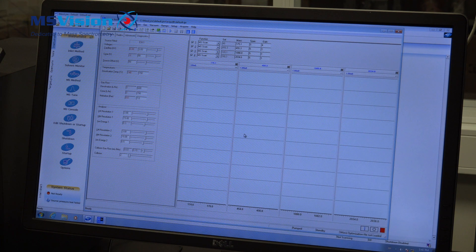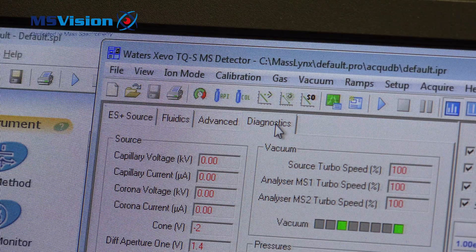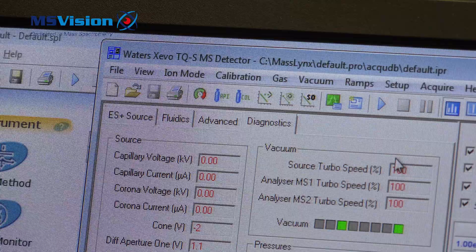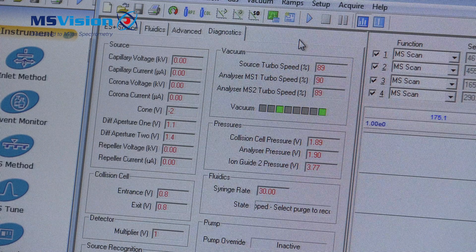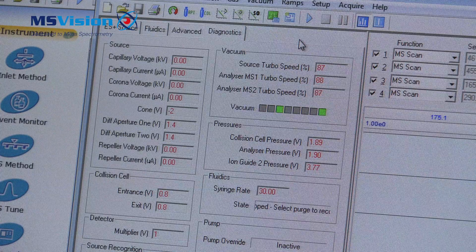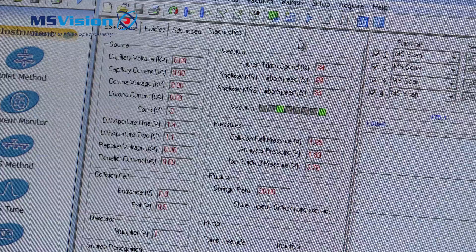Select yes to vent the instrument. On the diagnostics page you will see the turbo speeds lowering, and it will take around five minutes to complete the vent cycle. The roughing pumps below the instrument will be automatically switched off in a proper manner.